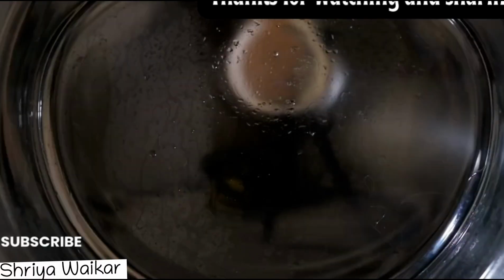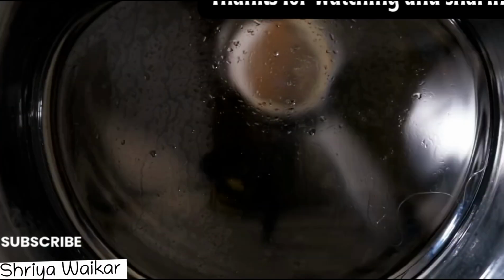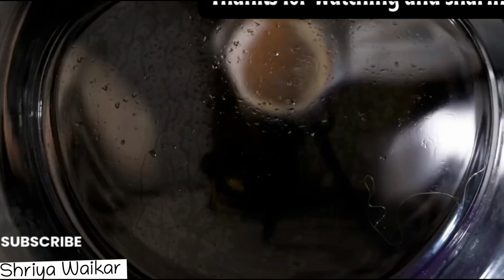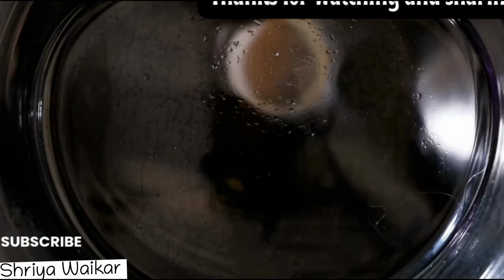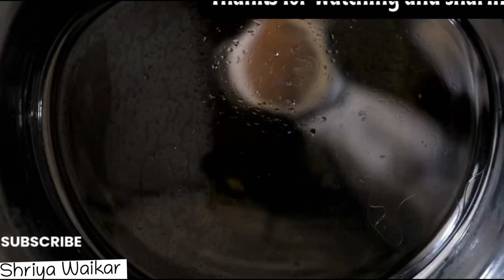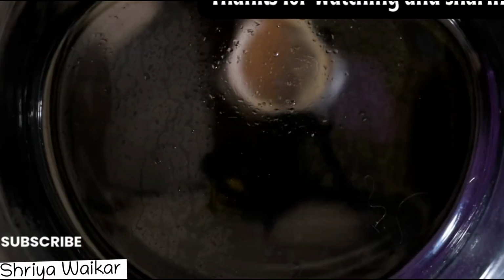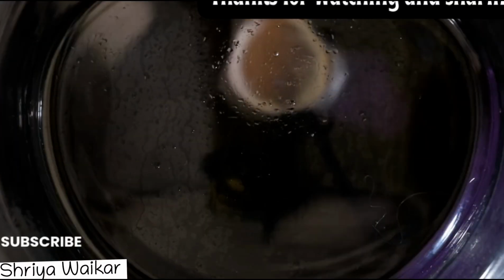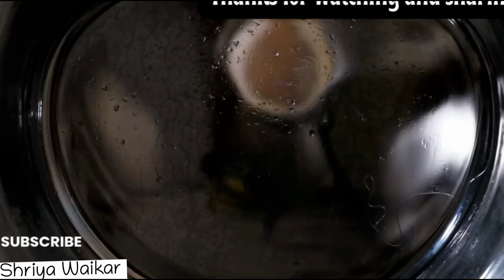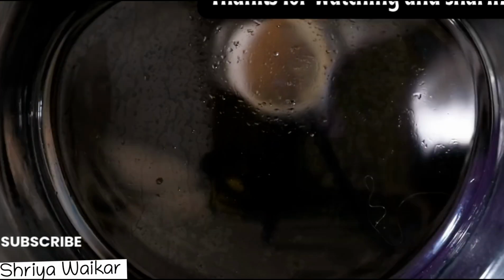What are the various types of centrifuge? Based on the principle and application, there are differential centrifugation, density gradient centrifugation, and ultracentrifugation. Differential centrifugation is based upon the difference in the sedimentation rate under centrifugal force of particles of different size and density. It is used to separate large cellular structures, nuclear fraction, mitochondria, chloroplast, and large proteins.